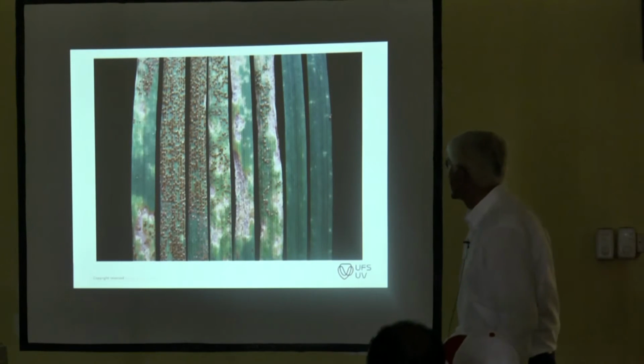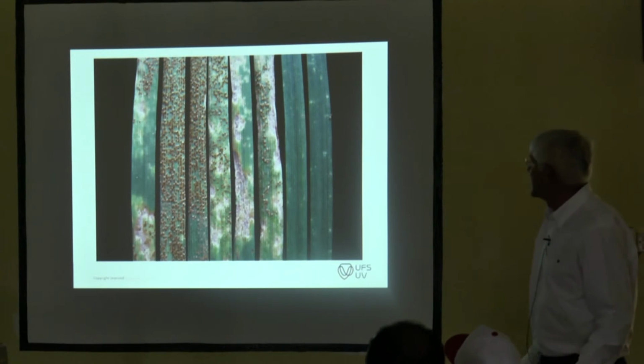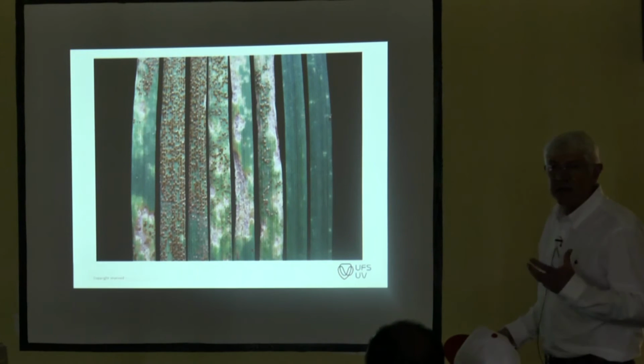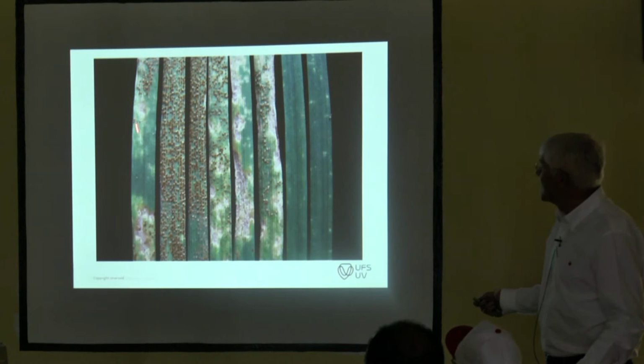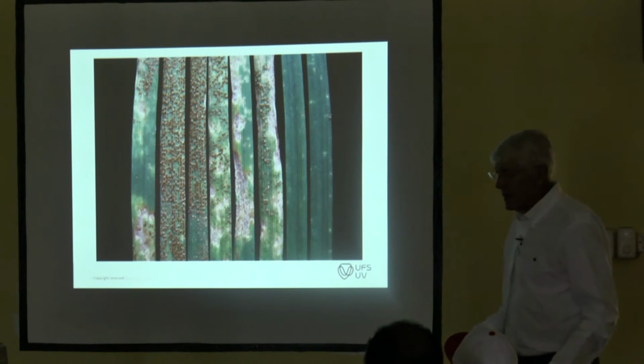Just a few examples. Again, you may say this is leaf rust, but it's not. It's actually Puccinia striiformis. It's just the setting of the camera. Clearly low, am I right? And some genotypes give a very necrotic, very strong hypersensitive response, although you get a fair amount of sporulation. That's susceptible, that's susceptible. Low. And those two, I think, are pretty clear.